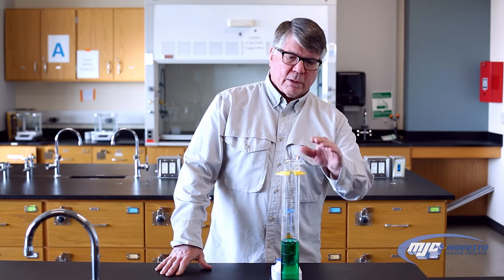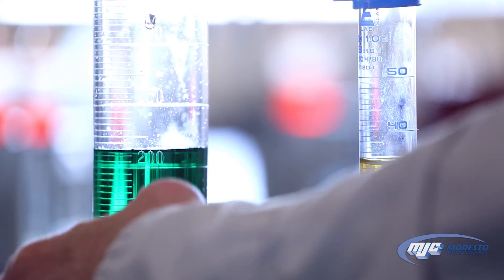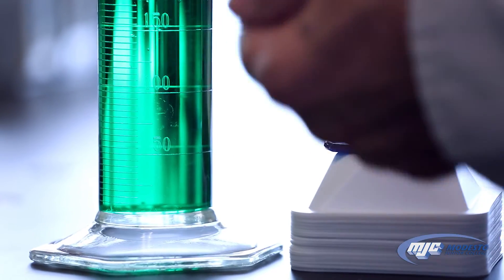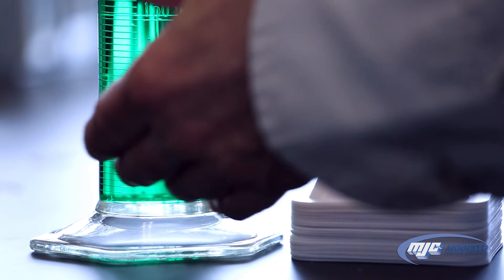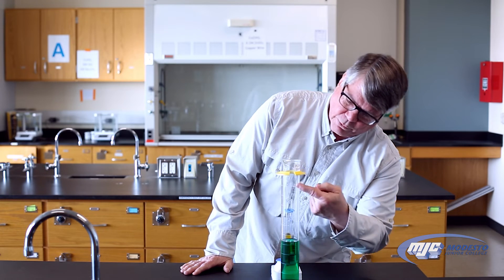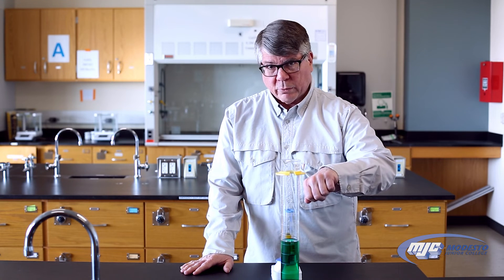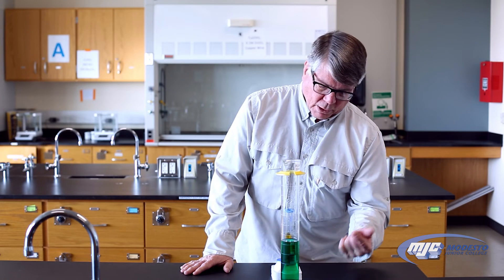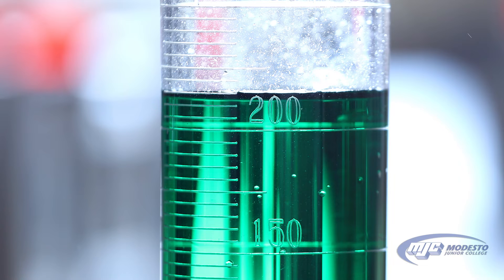Let's read the volume in this large graduated cylinder first. Some graduated cylinders, such as this one, have two different scales on them — it's really important that you read the correct one. The scale on the right starts with zero at the bottom and ends at 500 at the top. The other scale starts with zero at the top and has 500 at the bottom. Because we're measuring how much liquid we put in, we always use the scale that starts with zero at the bottom.